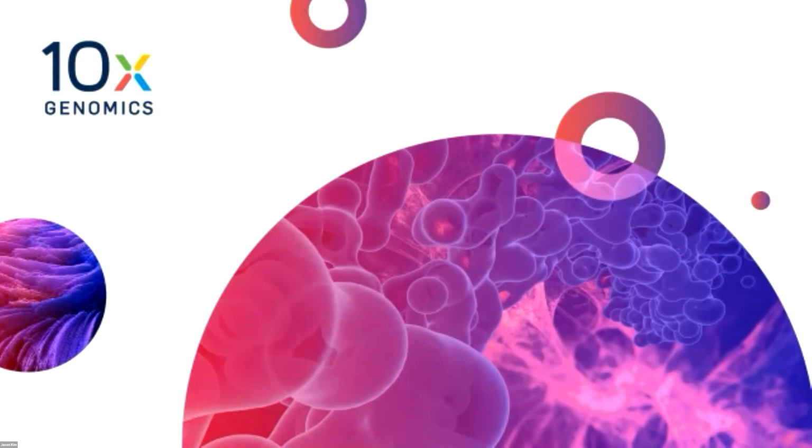The challenge, I would say, is you might lose most of the resolution. At that point, you'd be doing something similar to semi-bulk, right? Let's say you are able to detect them, and now you're able to detect them in which spot. But beyond that, you wouldn't be able to get much more information outside of qualitative metrics, because you'd see, okay, I see a lot more sequences for this particular bacteria in one spot, 10-fold more than somewhere else. So you just know in general there may be more there.